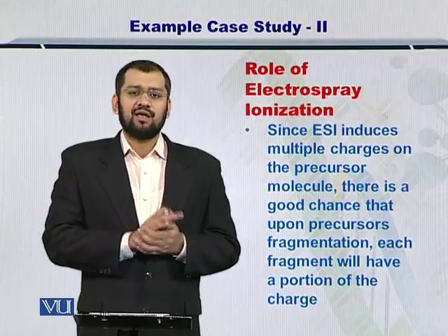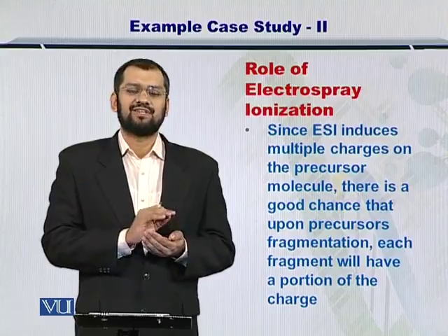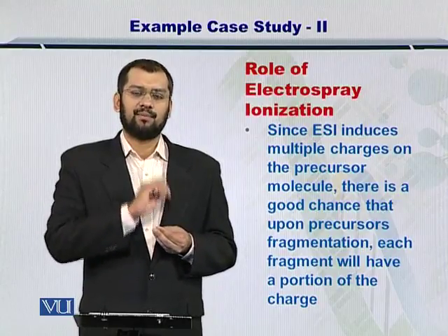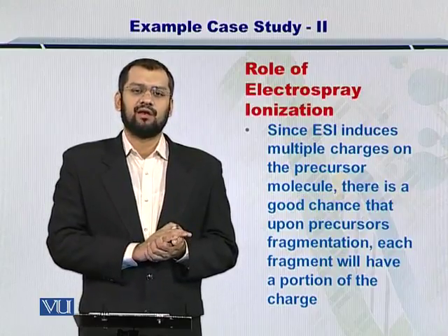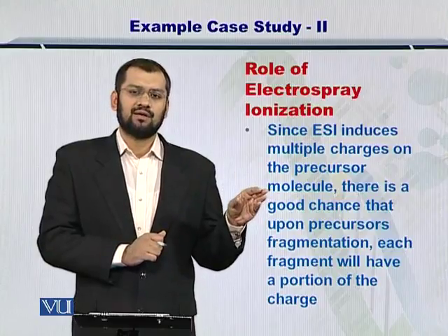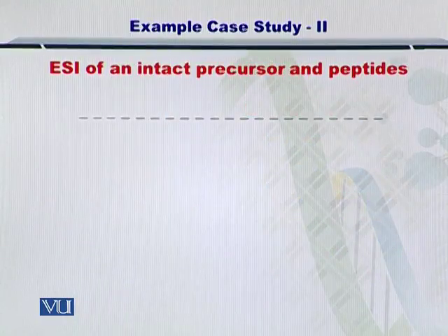So ESI is the strategy that is used for tandem MS or MS2. If you were to use ESI for MS1, then you will have multiple ion states, multiple charge states, and this will create difficulty in the charge resolution. Therefore, for MS1, you use MALDI. For MS2, you may want to use ESI. I'll give you an example here in order to further elaborate on the utilization of ESI for MS2.